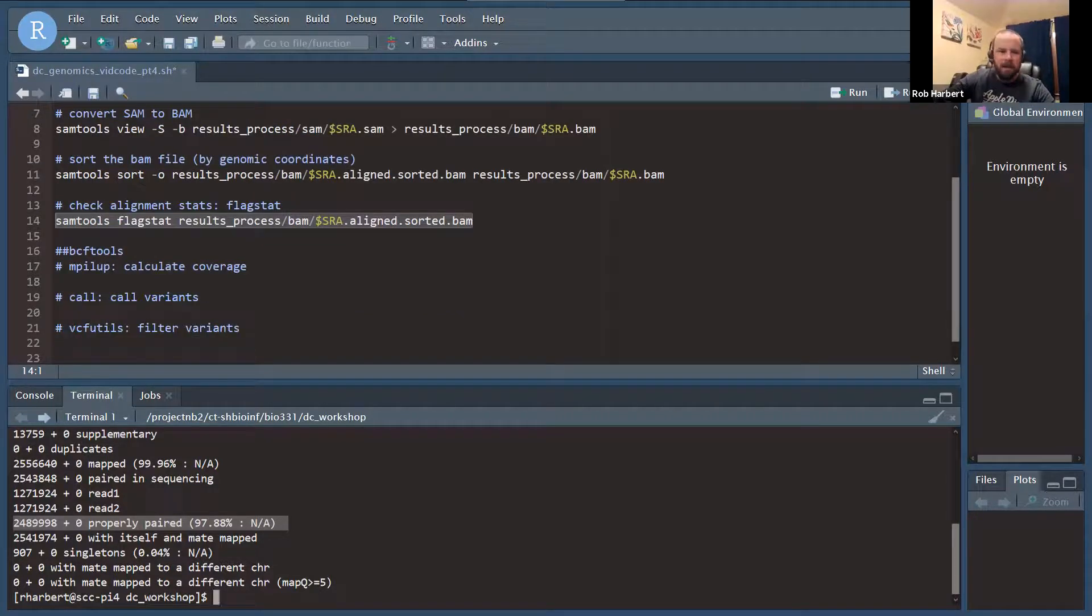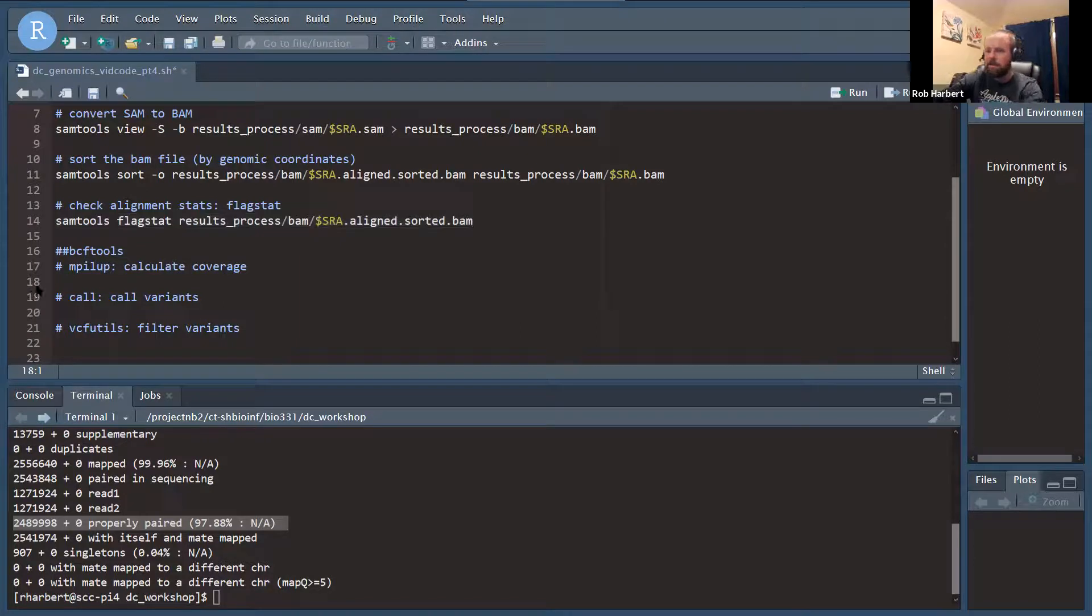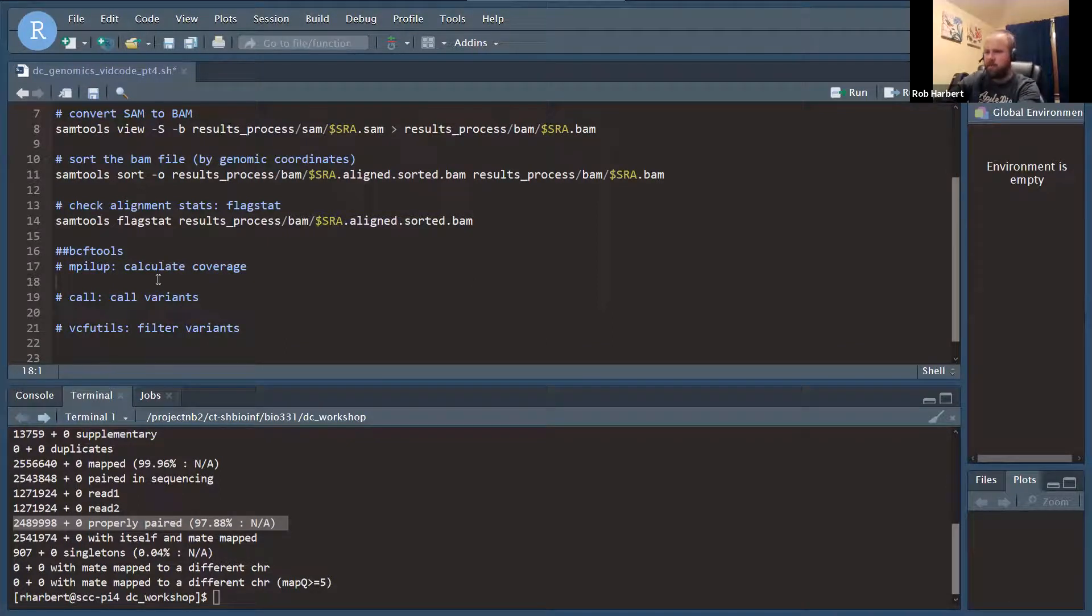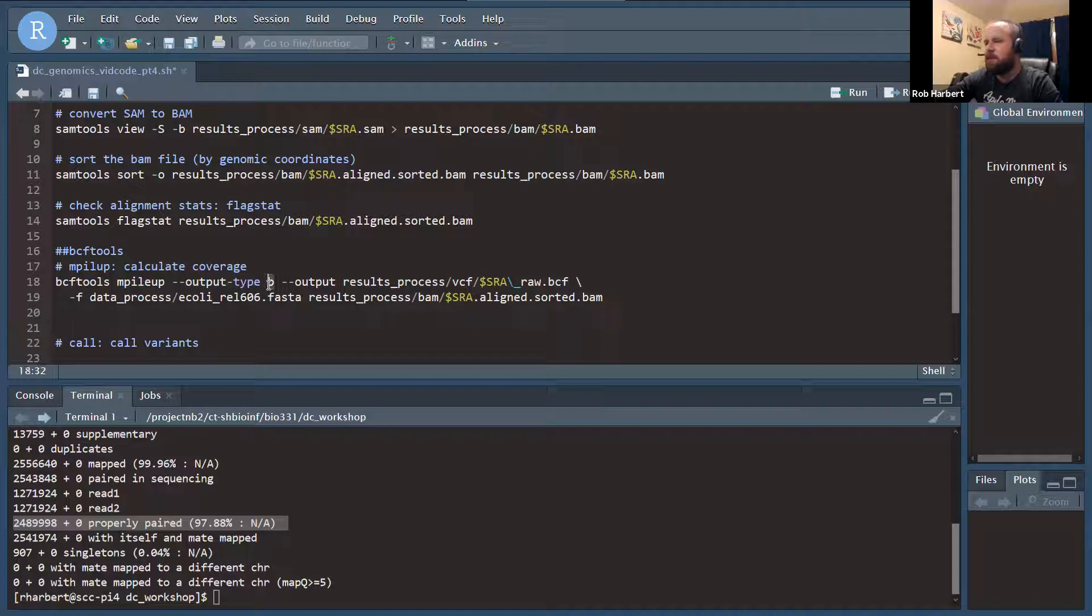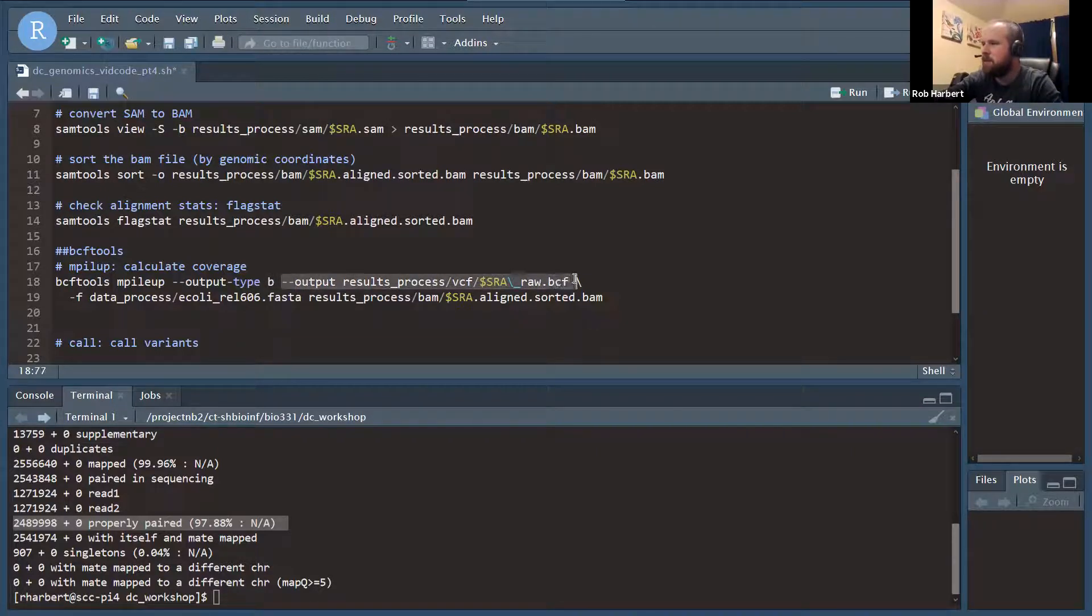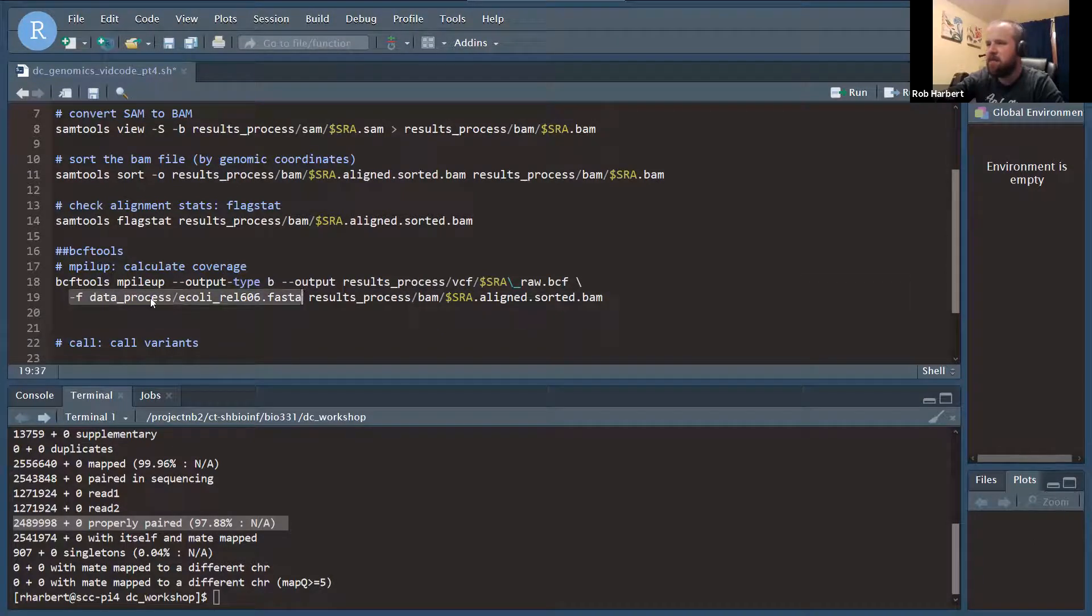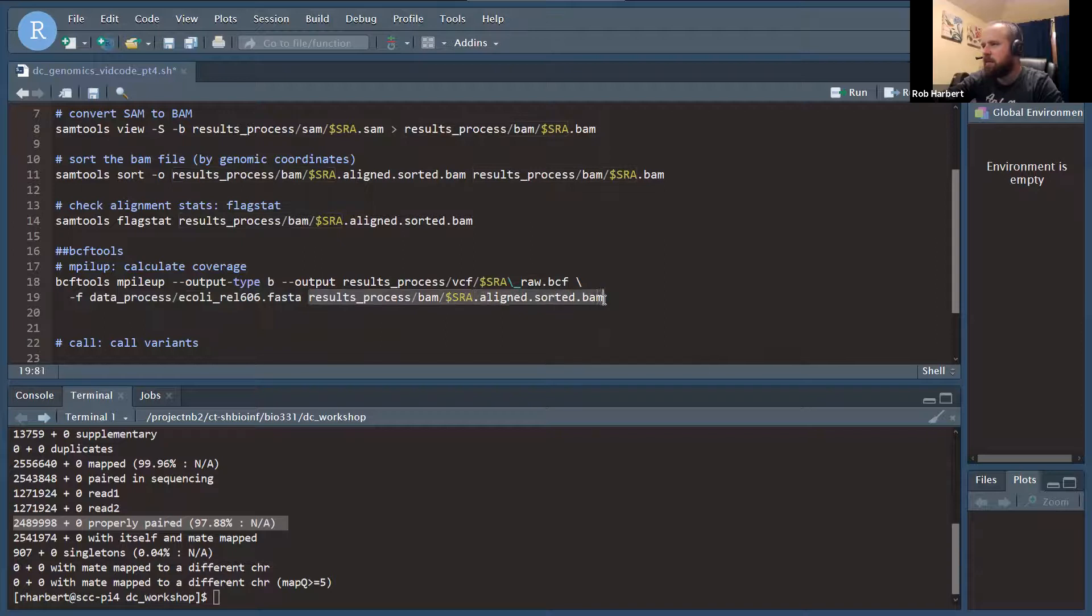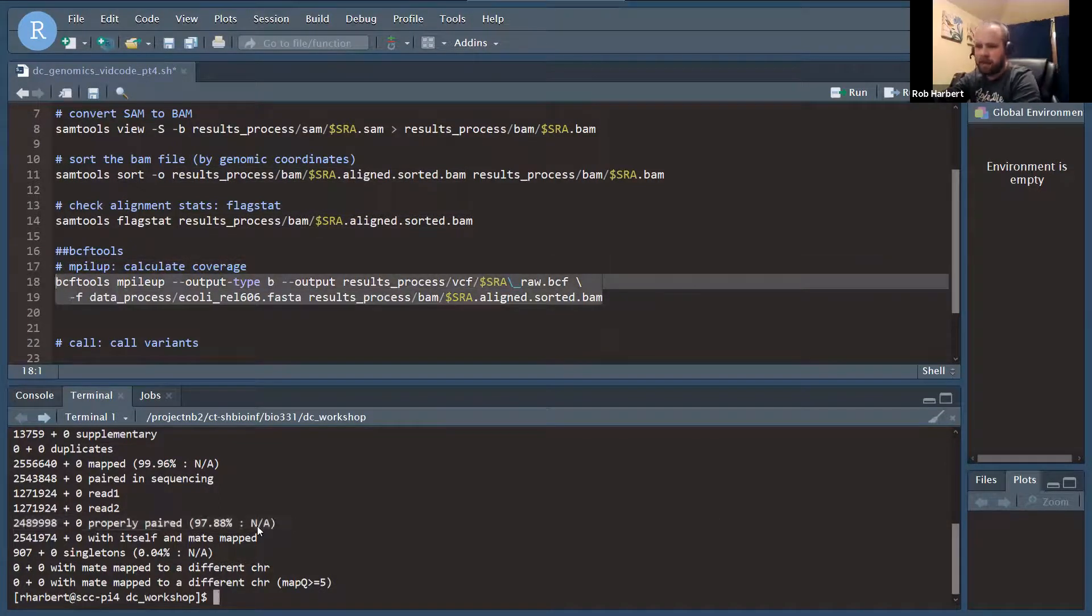Let's go on and convert these alignments to our variant calling. First up is mPileUp with BCF tools. mPileUp output type B, that's going to convert to the compressed binary BCF format. That's going to save on some space. Our output should be named dot BCF. Dash F is to the reference genome. That's our path to the reference genome, ecoli rel606.fasta. And then our input file, that goes back to our aligned sorted BAM file that we got up here after sorting.